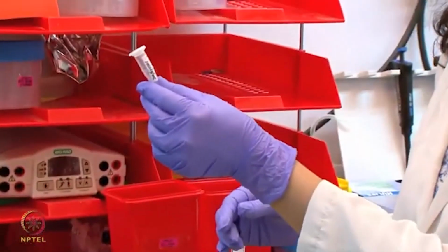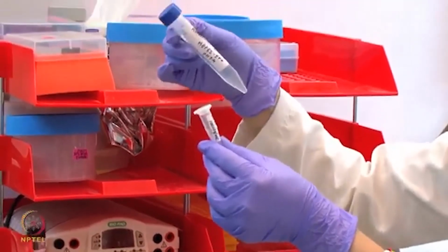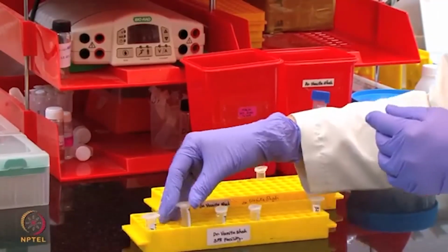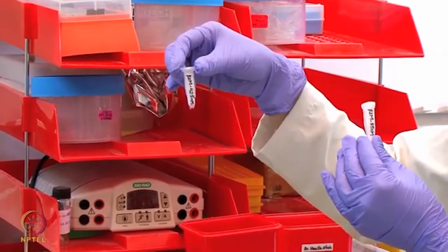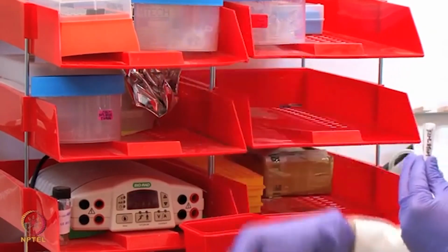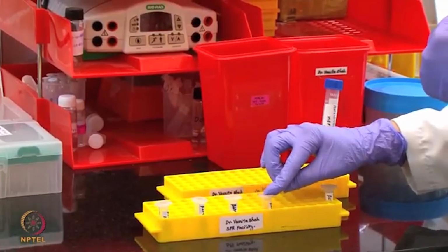We will dilute the stock solution of protein, that is 100 microgram per ml, in the running buffer HBS-EP+ to prepare 100 microliter of 3 different concentrations, that is 85 nanomolar, 42.5 nanomolar and 8.5 nanomolar, which are referred to as high, medium and low concentrations in the experiment.